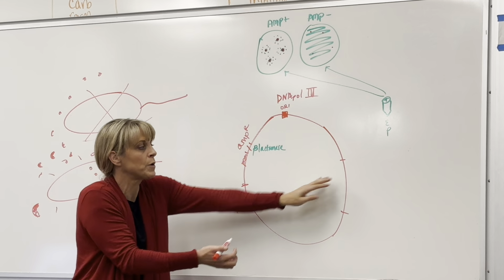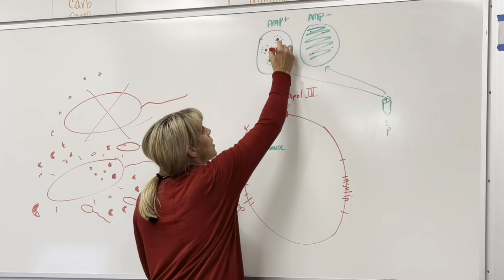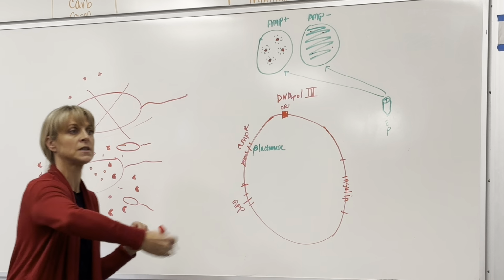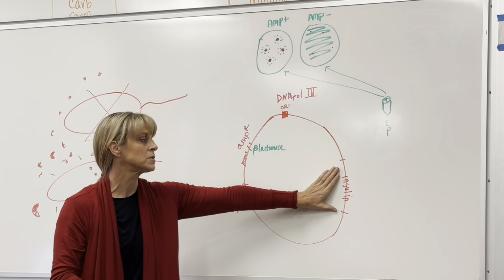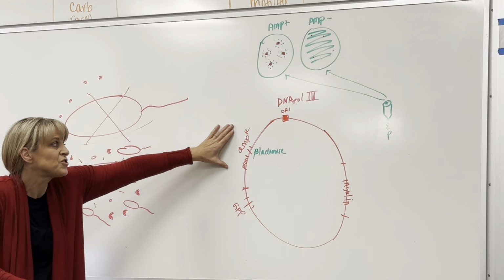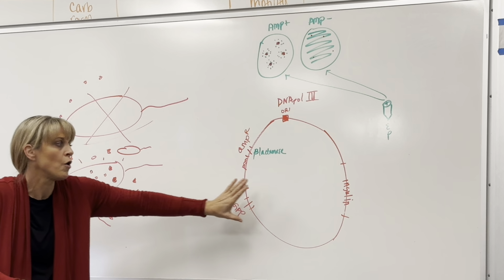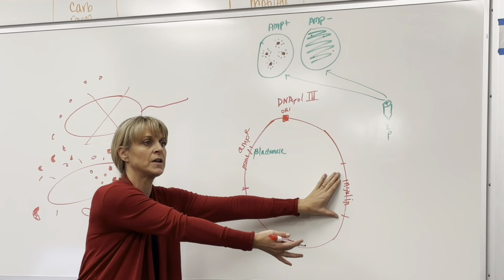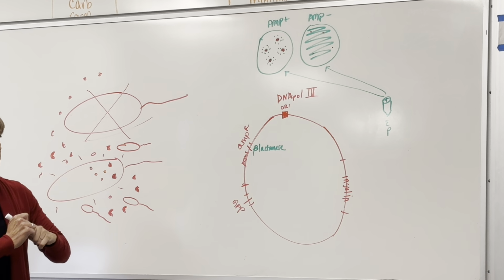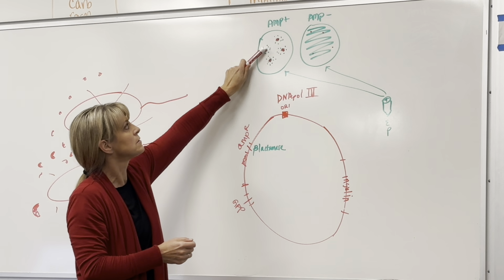But here, if we put in the insulin gene, now we can pick this colony, this colony, this colony, and they will start making insulin times a million. So this is the gene that you're experimenting on. This is just to be able to isolate, and this is just to be able to see if it worked. Over here is some functionality of it. We want it to do something now. And if they took it, every single transformant on the ampicillin positive plate would have our gene of interest. Yes. So this is insulin. Yeah.